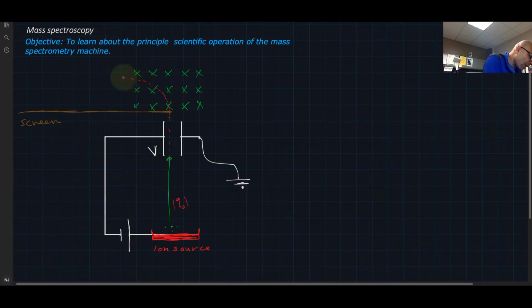A circular path. And as soon as it forms this path, it falls onto a screen and makes a bright spot here on the screen. An operator will come and measure that bright spot. Knowing where it started, they can know the radius of the circular trajectory. This is the radius. That is one of the pieces of information we will need. We will need other things.